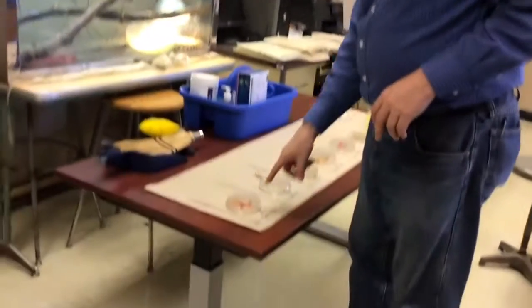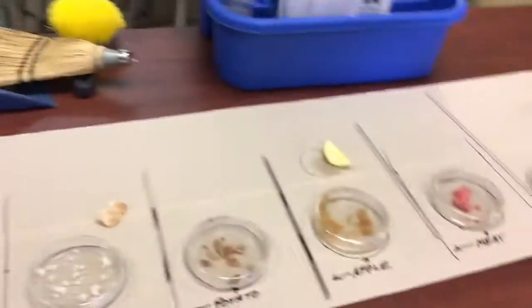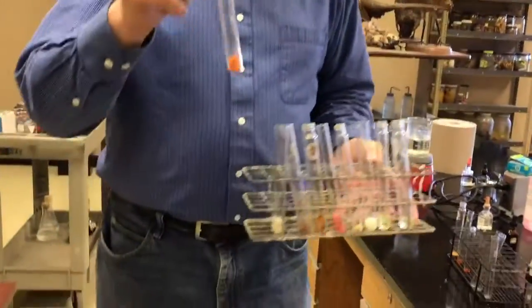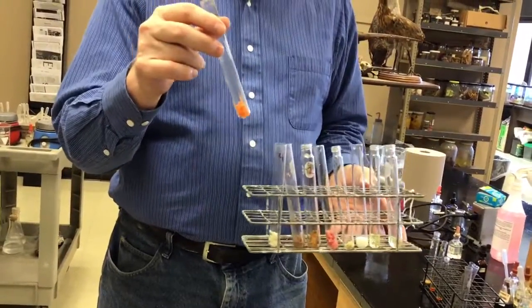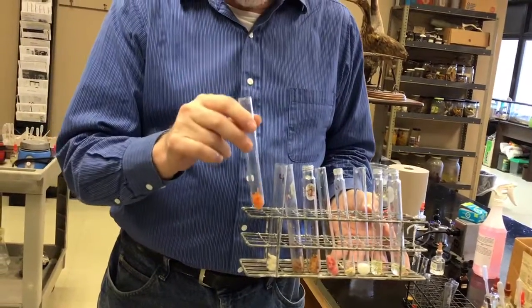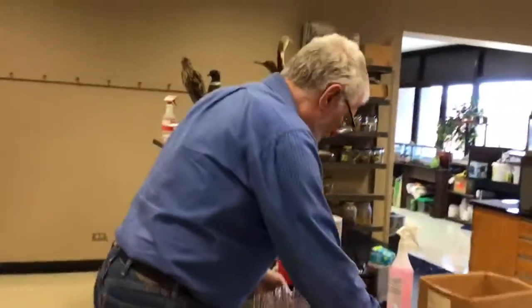What I did, because I need the chemical to really mix well, so I need a lot of surface area, I ground up the foods that can easily be ground up, and I put them in the bottom of these test tubes. So you see, there's ground carrots and bread and everything is ground up in there. Now, obviously, this is not 6 drops of carrots. So following the directions that say put 6 drops of whatever in, what I want is to see if the colors change. So I gotta put plenty of reagent on this. And then I gotta give it a couple of minutes to change. So that's what I'm gonna do.